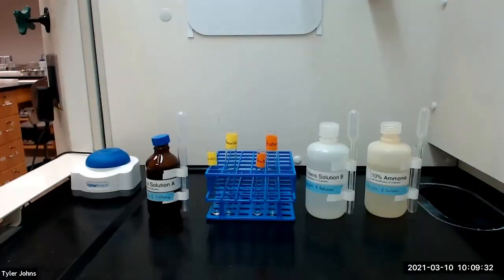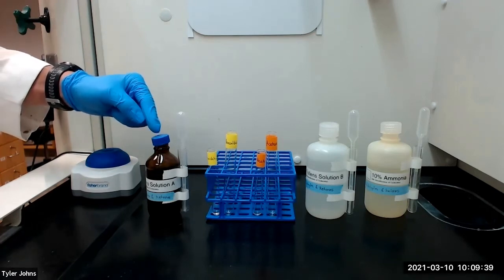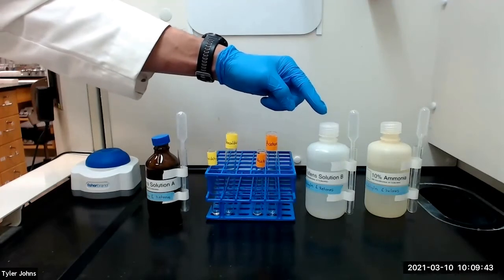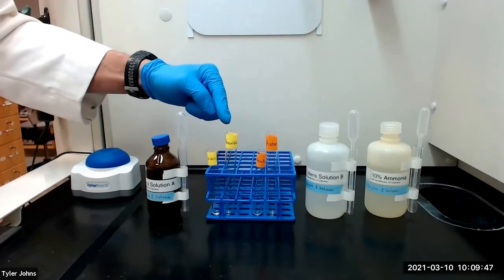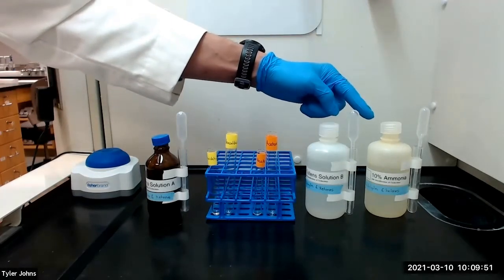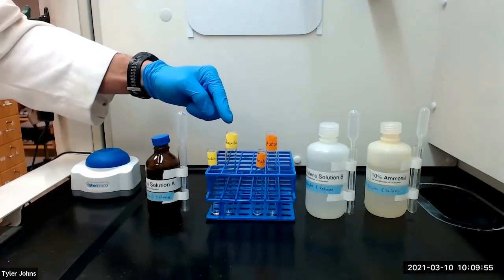We will next prepare the reagent for each test compound by mixing one milliliter of Tollens solution A, a silver nitrate solution, with one milliliter of Tollens solution B, a 10% sodium hydroxide solution. A precipitant of silver oxide will form. We will then add enough 10% ammonia solution to the reagent mixture to just barely dissolve the silver oxide.